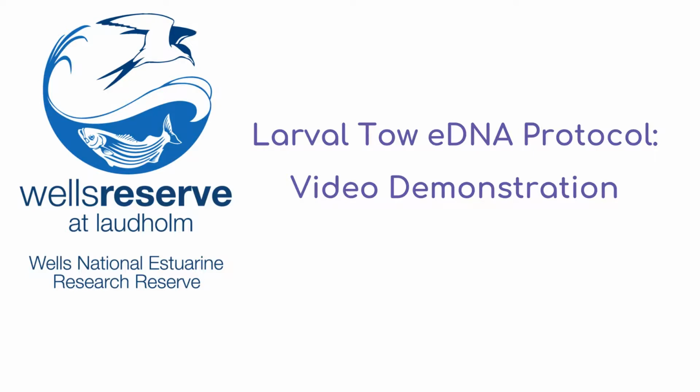This is a video demonstration of the WNERR larval fish eDNA protocol for larval tows.